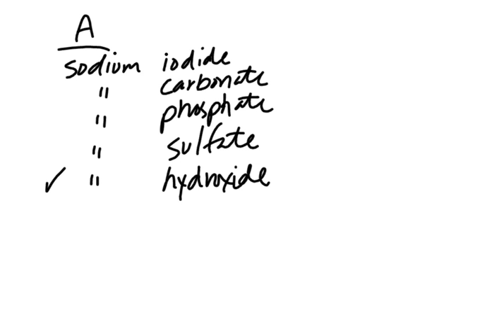Your chemicals for B are going to be, and we have a couple of different mixtures here.